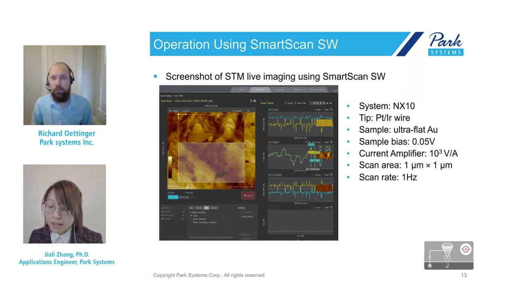And also you can coat your tip with some chemical molecules, such as non-adhesive molecules, to reduce the adhesion force. I will usually use some silane coating on the tips before doing the image. And this is a very acceptable coating method for AFM probes. You can just log on to a website and Google silane coating for probes, and then you will get the protocols.